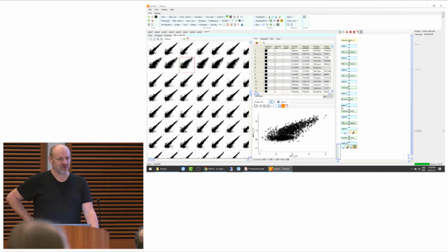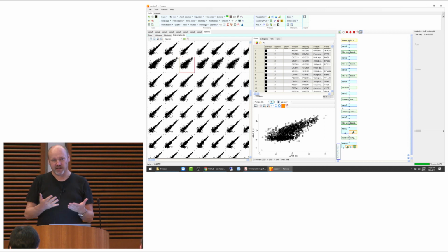It would be good if the contamination is reproducible, because then it wouldn't show up in the t-test, right? One should somehow randomize this in a way that the contamination is not systematically correlating with the treatment, right? But that's the general statement. As soon as you have that, sure, do it again, throw it away, right?